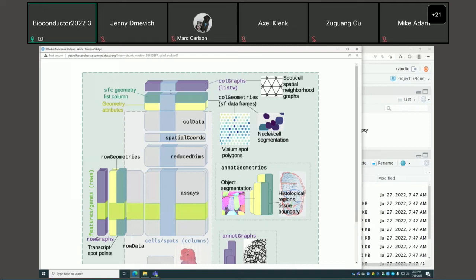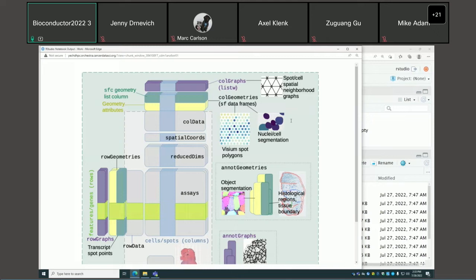We also have spatial neighborhood graphs associated with the columns and rows of the gene count matrix, stored as listW objects from SPDEP. Rather than using colPairs from SCE, we use listW objects because they're used in SPDEP, spatialreg, and spdep spatial packages for spatial dependency analysis — avoiding the need to convert objects every time we do analysis.